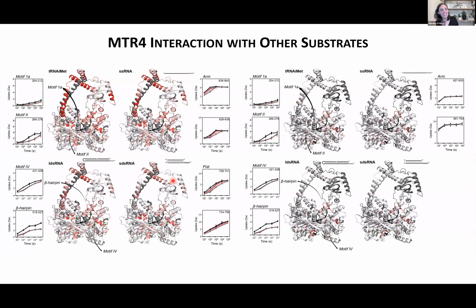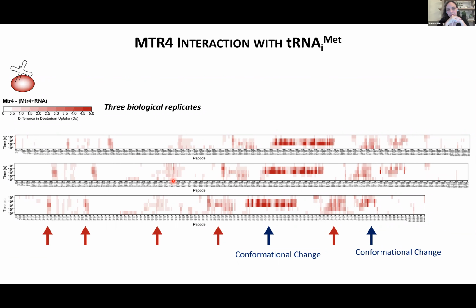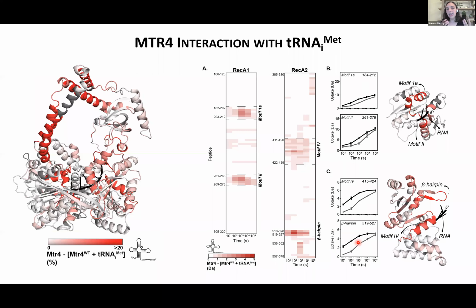Yes. So this is definitely something that is a gray area in HDX, and by gray I mean maybe not everybody agrees. But the one thing that most people can agree on is that when you see a change in HDX, you can never assume that it's conformational or binding. Both of them are possibilities. Now, sometimes that's presented as a negative, but I present it as a positive because there are not very many techniques where you can detect conformational change. In this case, I will say we may be going out on a little bit of a limb, but we've now done several projects where just looking at the kinetics and the shapes of the curves can allow us to bin peptides into particular patterns.